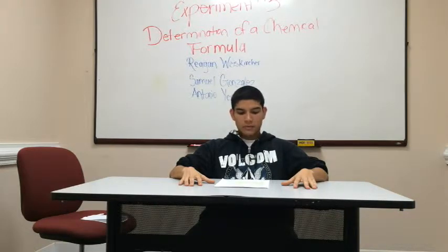Measure out about 20 centimeters of aluminum wire. Coil the wire and place it in the beaker solution so that it is completely immersed in the copper chloride. Note that the reaction produces gas. Elemental copper is forming on the surface of the aluminum wire, and the color of the solution is fading. The reaction will take about 30 minutes to complete. When the reaction is done, the solution will be colorless.